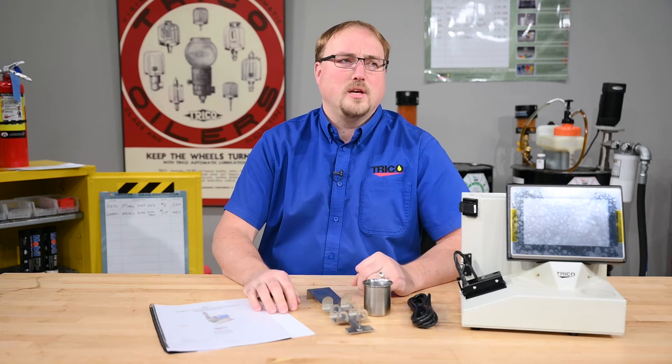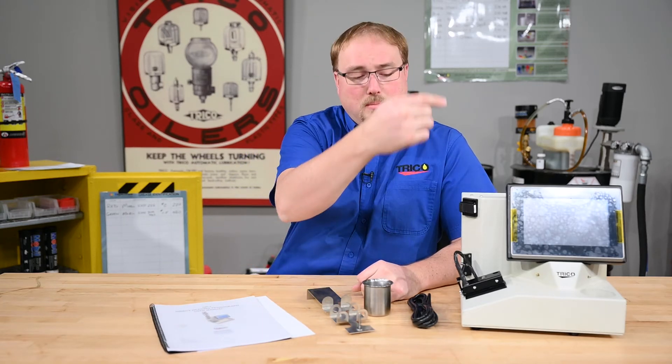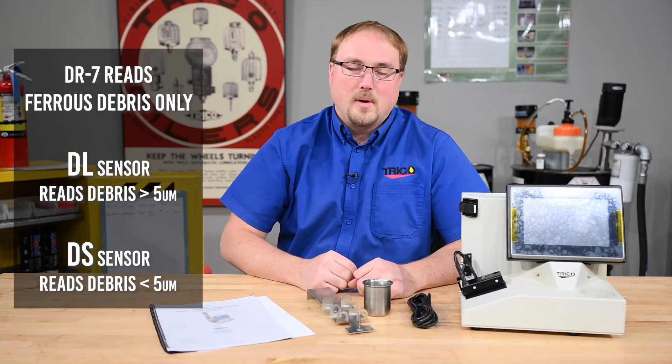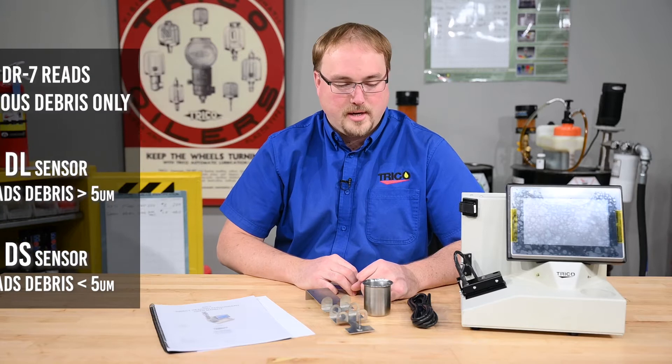The DR7 is for particulate matter. Basically you pass oil from the vial through the sensors and it reads the large and small particles, then puts a numeric value to the 10 micron and the 5 micron particles that it reads.